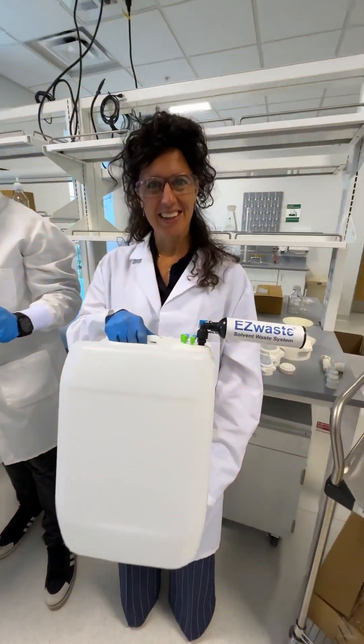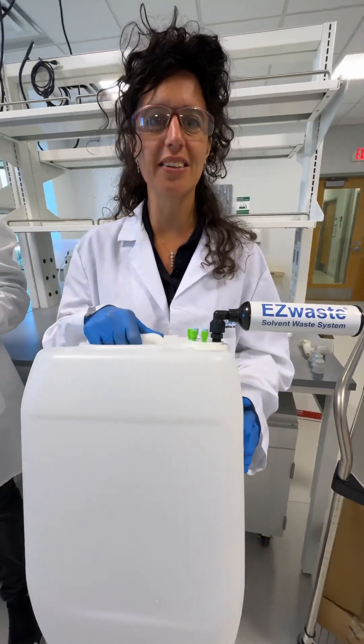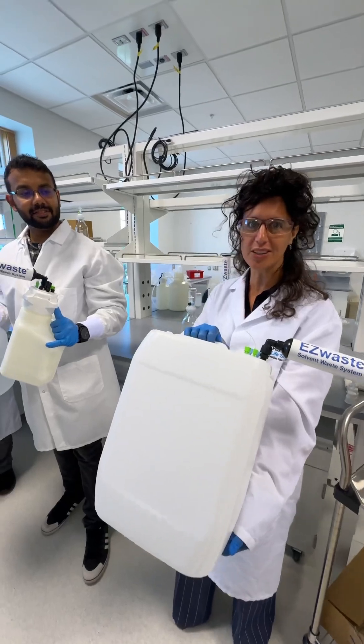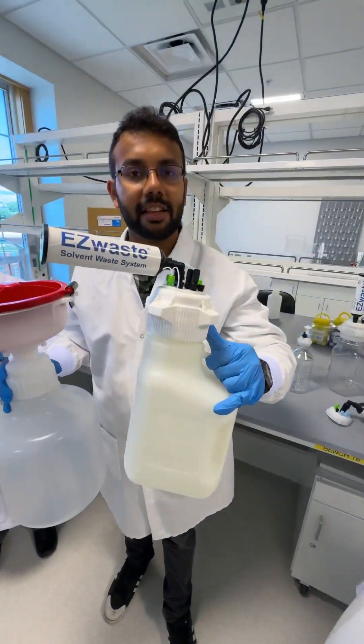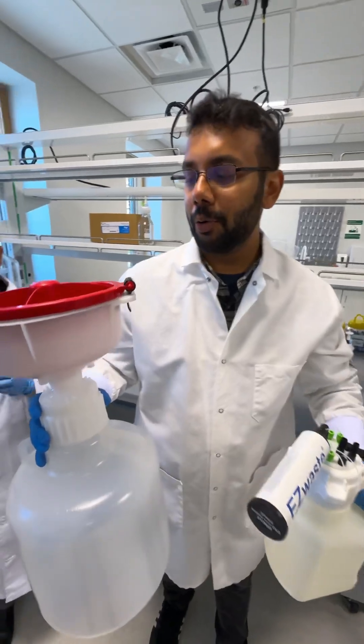Aliche, what do you got? Today we are here at EasyWaste, the best system to collect the VOCs from HPLC machines. This is our version in UN DOT containers. It also comes in our EasyGrip Cowboy from 2.5 liter to 75 liter.